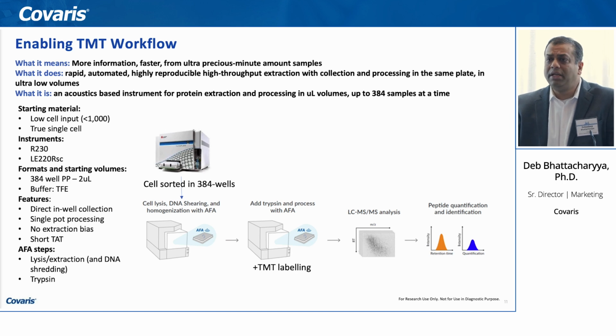So this is completely agnostic of whatever LC or MS systems you are using. Of course, most people here are probably working with high resolution accurate mass, but it also works with triple quadrupoles, so that doesn't really make any difference.